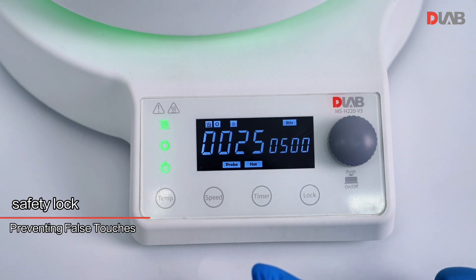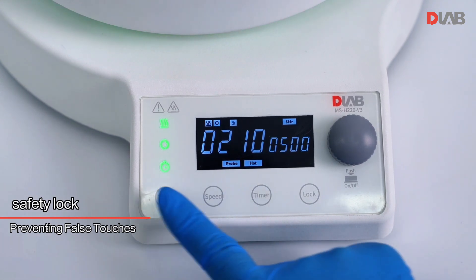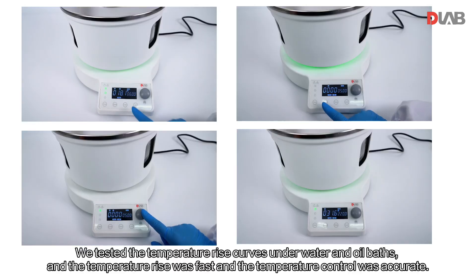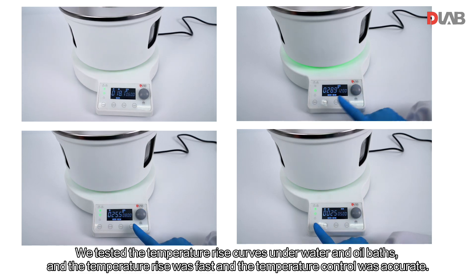Safety lock prevents false touches. We tested the temperature rise curves under water and oil baths, and the temperature rise was fast and the temperature control was accurate.